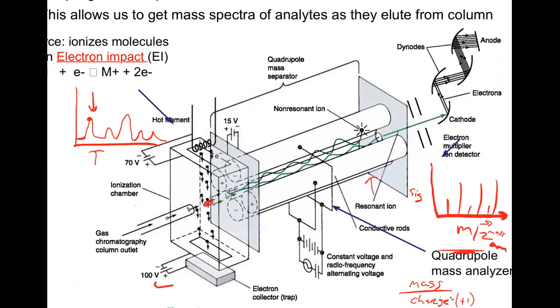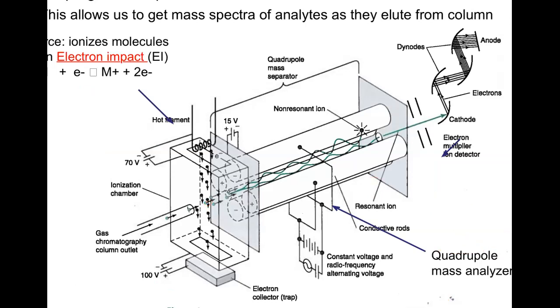And we know that if we add up the parts from the periodic table, we can predict what the mass of certain ions are, right? So because we know the mass, we kind of know what the ions are, don't we? And that's a very, very powerful thing, I think, okay? Because not only do we get the retention time behavior in the chromatogram, what time it elutes, but we can also figure out what the masses are. So that tells us about what that substance might be, even if we don't know, okay?